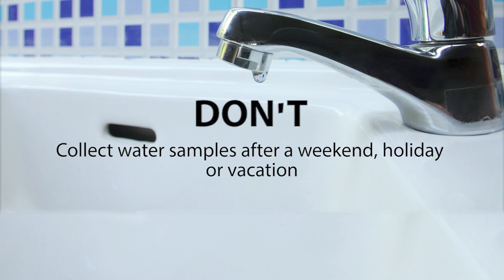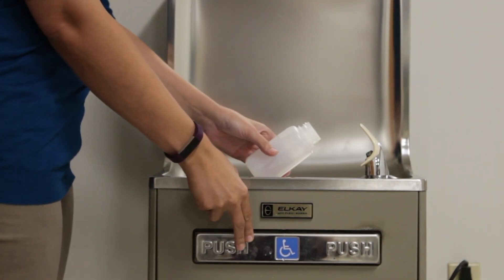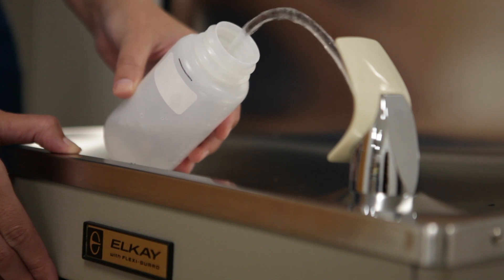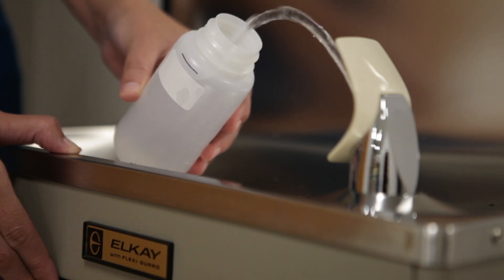Don't collect water samples the day after a weekend, holiday, or vacation. Don't touch the mouth of the bottle or the inside of the cap, and don't rinse the container. Don't remove any aerators or strainers from the faucet. Place the open sample bottle under the faucet and slowly turn on the cold water. Bring it to a normal flow rate, similar to how you would fill a glass of water, up to the sample line.